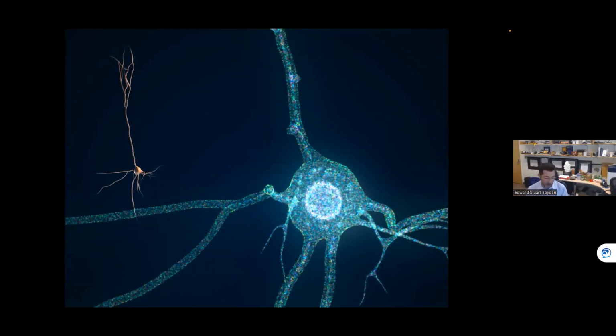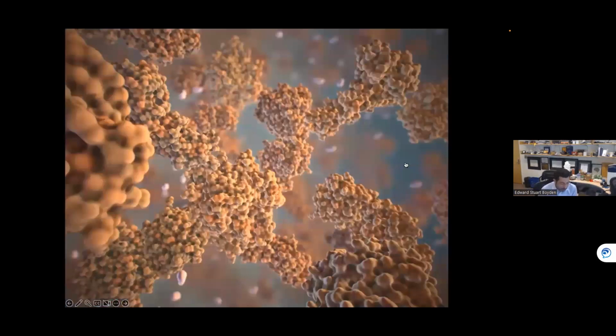So, of course, this only works on preserved specimens, not living ones, but it allows you to get a molecular map of what is inside the cell, tissue, organ, or organism. The following 4 cartoons illustrate how the technology works. And for all expansion protocols, our group, of course, developed the first one, but now many groups are developing variants that are customized for different purposes, like expanding bacteria or expanding bone. But all protocols more or less have the same kind of steps.